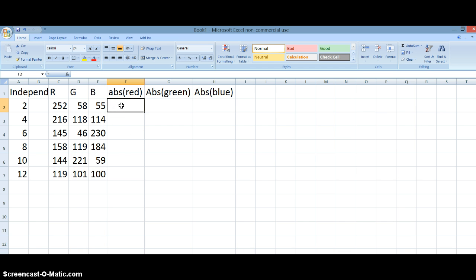Once you have those, then it's a matter of calculating out the absorbances. So the formula for absorbance is you type in equals -1 times the log of, and then since I'm doing absorbance red, I select my red channel. And then you divide by whatever number goes along with your control. That'd be your water or whatever thing has nothing added, or if you're doing your fingernails, maybe it's just a picture of your fingernail with nothing added.